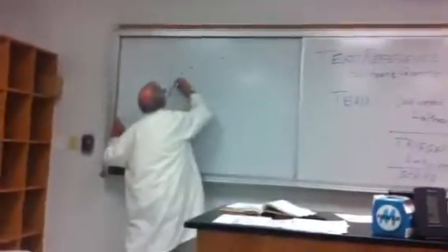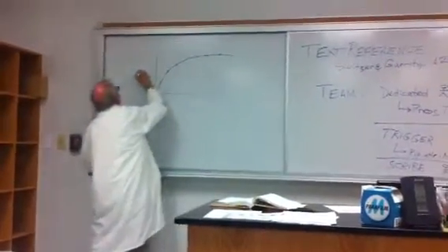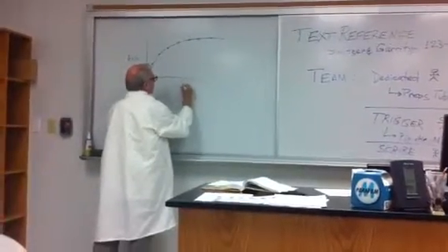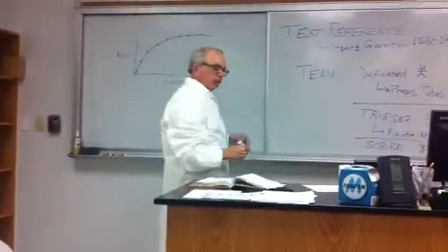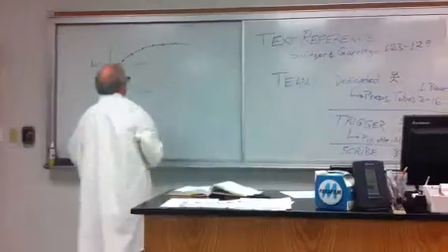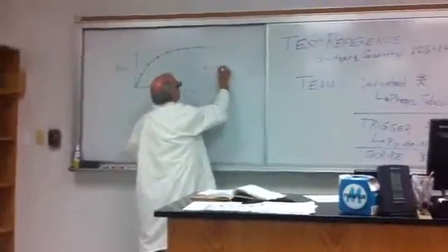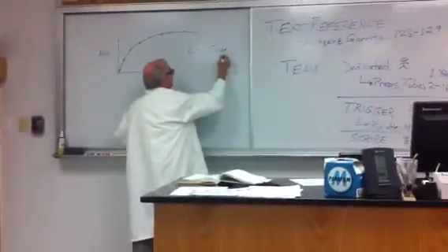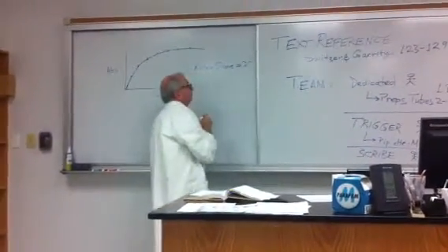And it goes like this. This is absorbance, and this is time. From this one trace here, you are asked to give me back a rate. The rate means rate equals slope of a linear regression. And that equals velocity of the enzyme.